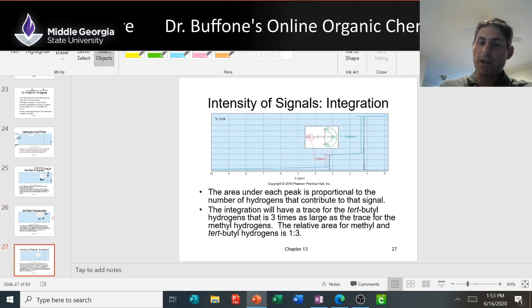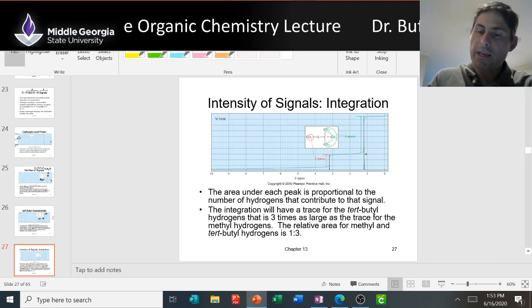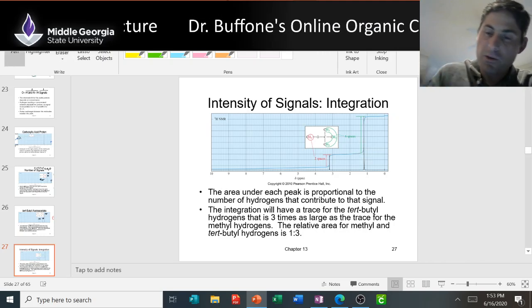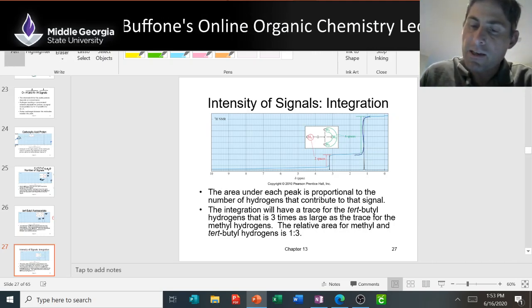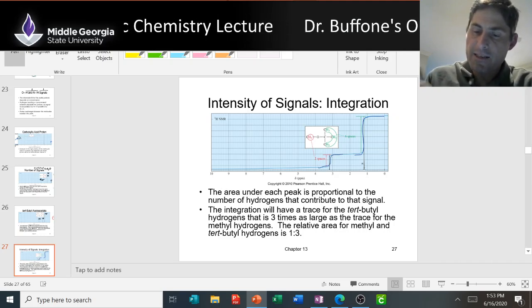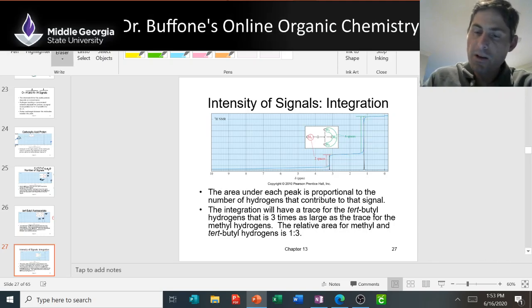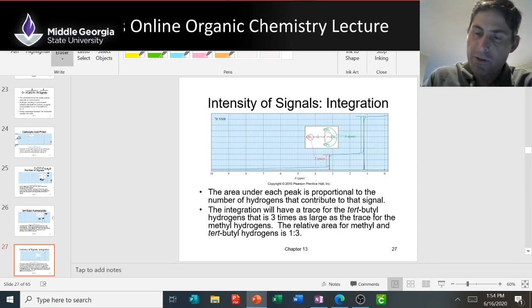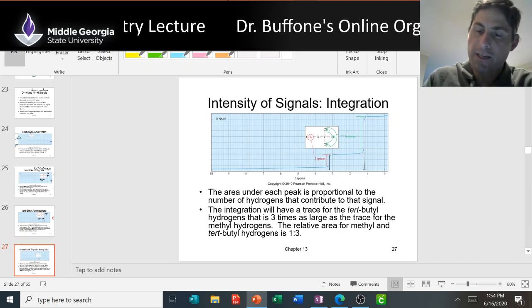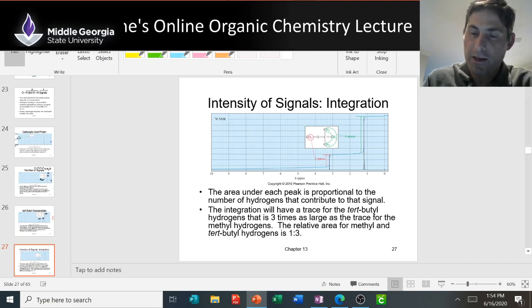And we talked about integration, right? In this type of graph paper, we looked at this molecule before, we can count spaces. This is this little, well, I'm going to do this in blue. This is this little S-looking integration thing that you see on the, so this in black is the signal, and then this guy is the integration. So I can measure from the bottom to the top, and you would count spaces, 1, 2, 3, 4, 5, 6. You could also get a ruler and measure in millimeters or centimeters, whatever you wanted.